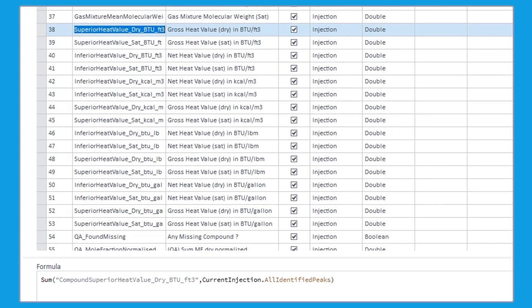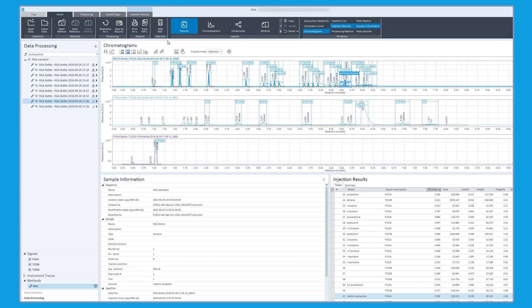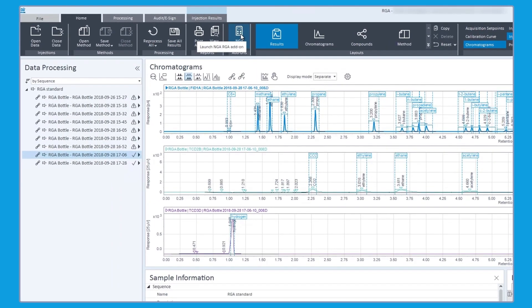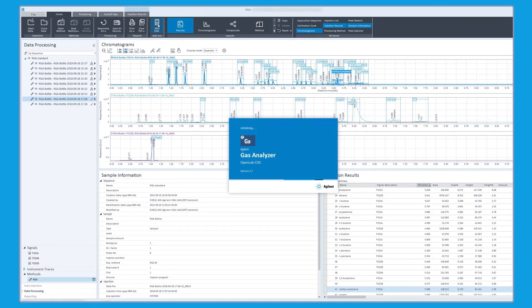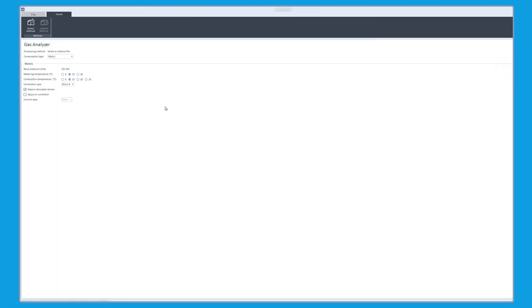Add-ons for NGA and RGA provide solutions for specific and commonly used analytical tests, simplifying calculations and reporting.